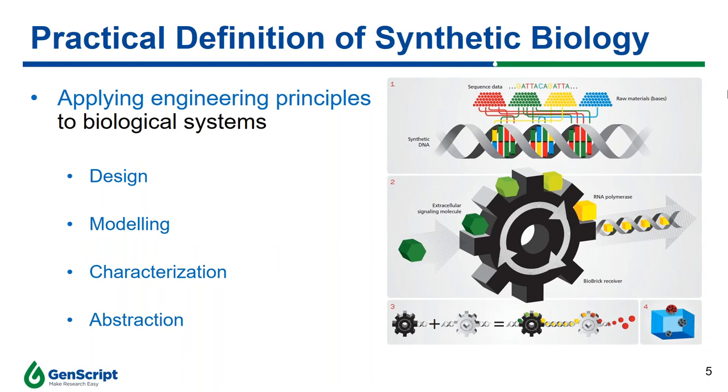This cartoon here shows that engineering begins by defining the sequence in the natural host and reconstructing it to become synthetic DNA. Then you can have this piece of DNA give you a function of interest in order to convert the input into a wide variety of the outputs that you want. Or you may string all of these devices together, where one has one function and another has a different function, and compile all of those to give you the features or structure that you are interested in.